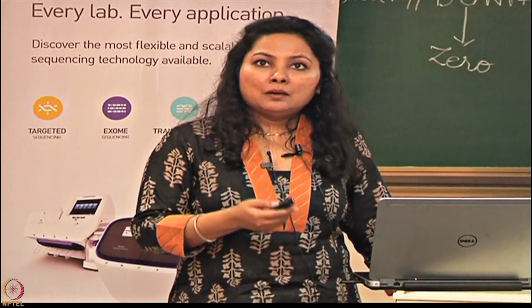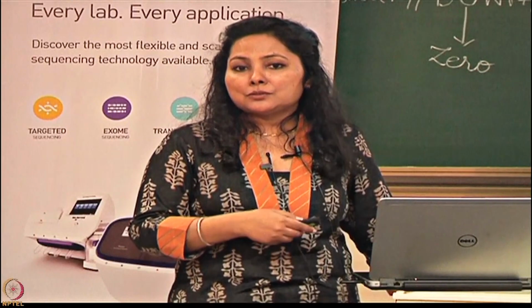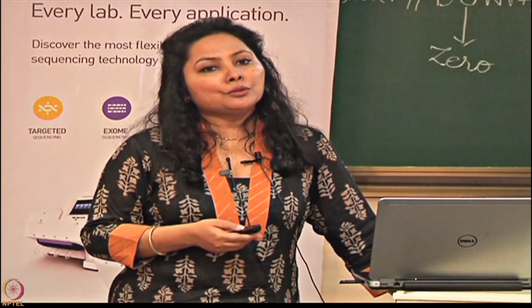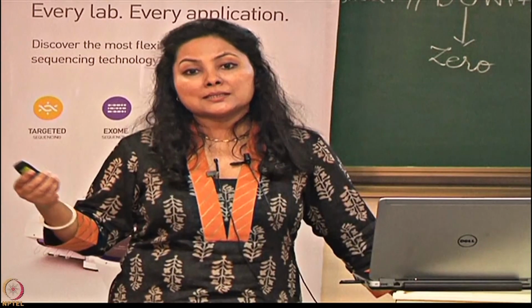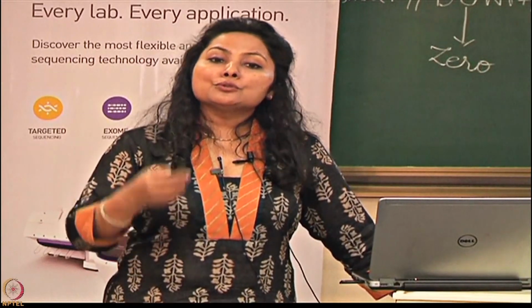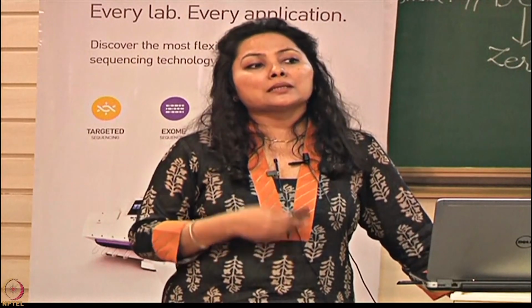So library preparation is basically a collection of fragments, whether DNA or RNA, which you finally want to sequence. The basic aim in library preparation relates to these next generation sequencers, where we talked about generating 200 base pair reads, 400 base pair reads, 600 base pair reads. Supposing we take an example of whole genome sequencing. With whole genome sequencing, your aim is to sequence that genome as fast as possible, and with as big reads as possible. So probably you will pick up a 400 or a 600 base pair chemistry, and what you need to do with the genome is shear it, break this genome into smaller pieces. That can be done by enzymatic treatment, or by sonication.